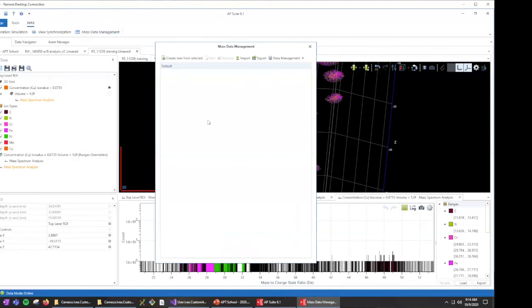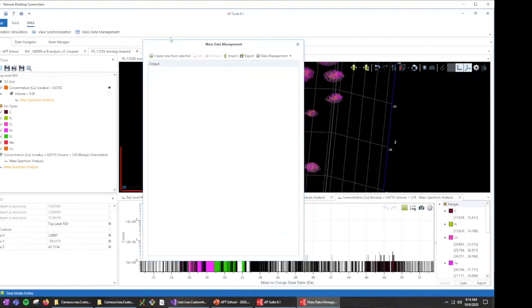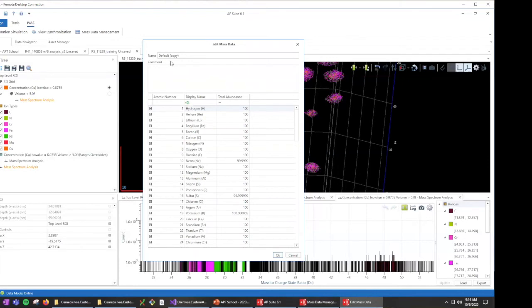And that is, do you want to demo the C# script interface? Sure. Now you can have custom isotopic ratios. So there's the default one, which is the best known published isotopic ratios that we have now. But if I want something different, I can make a new one. A good example would be you have a FIB that you're using to make your specimens that has an isotopically pure gallium source, and so when you're looking at your gallium peaks, they're not actually the natural abundance of gallium.